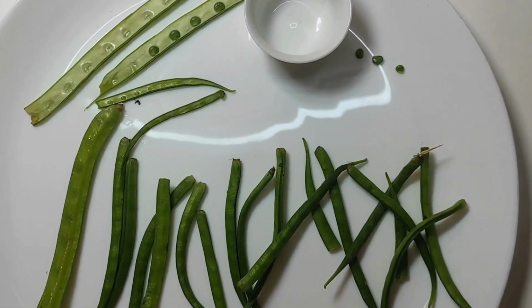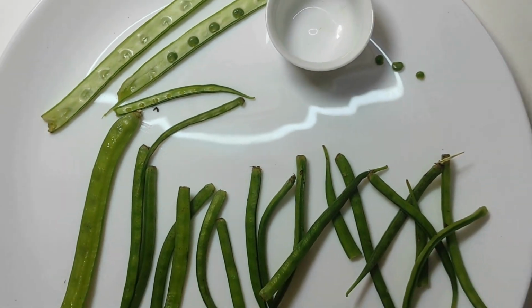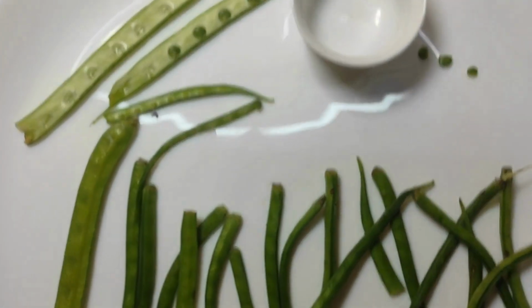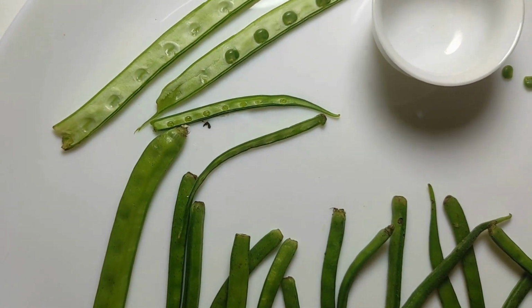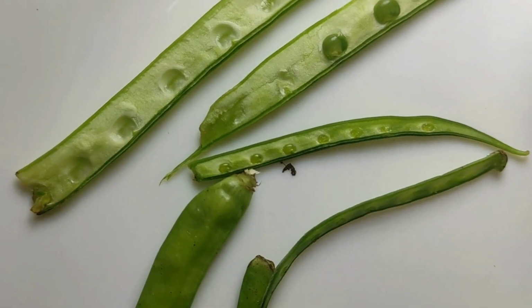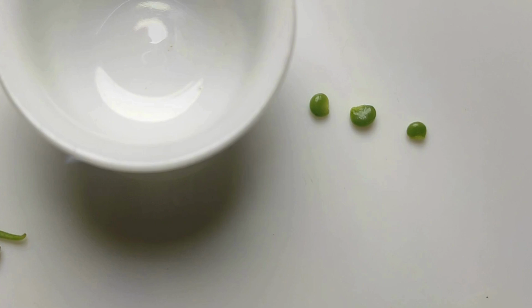Selection of pod is more important. You should always select the smallest pod for the embryo mounting and avoid the mature one. The smaller the pod you select, the higher the chance of getting the initial stages of embryo development, like heart shape, initial or late torpedo stage. If you select the larger pod or the mature one, you will end up getting a mature embryo.